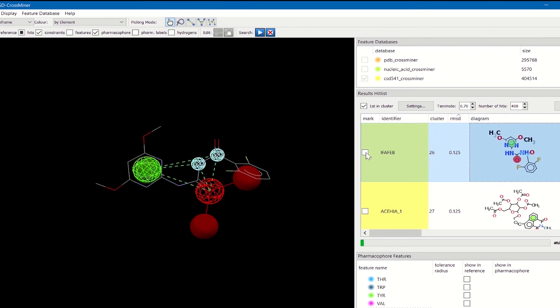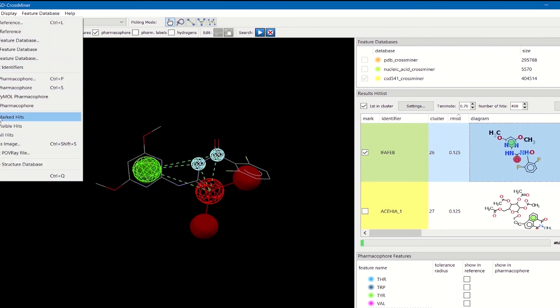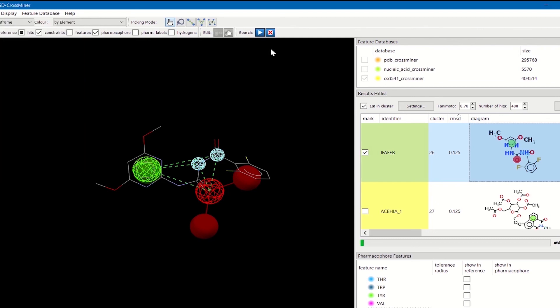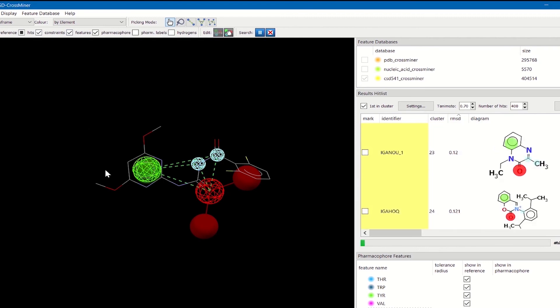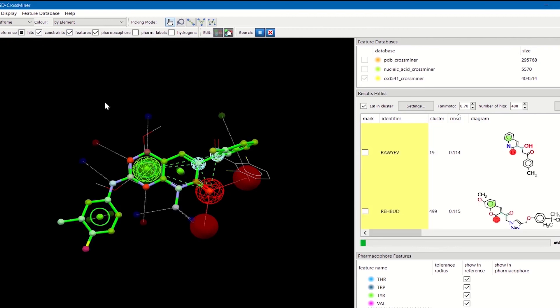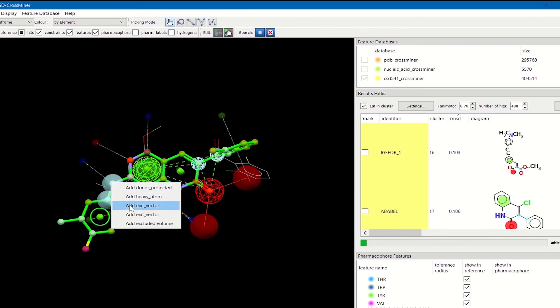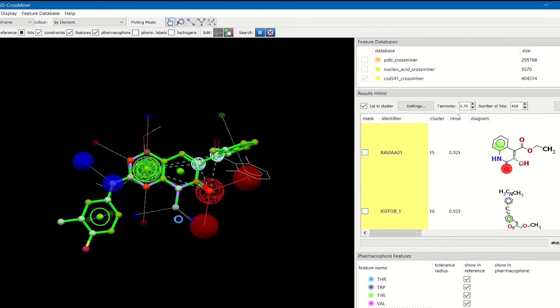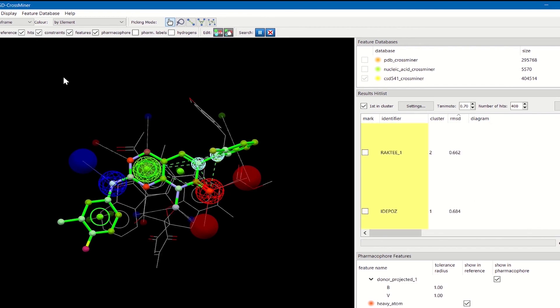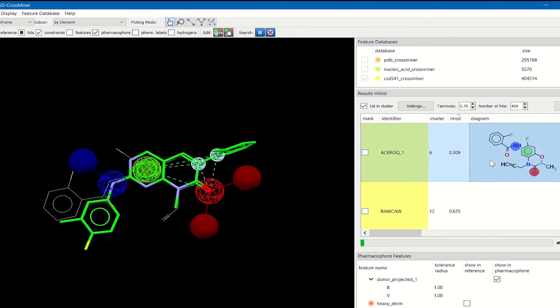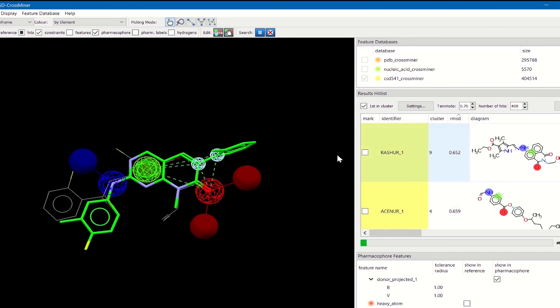Interesting hits like this one can be marked and saved for further analysis. If you want to continue your search or modify your query, you can actually do it on the fly — for example, adding a new pharmacophore point to your original query, such as a donor projected. This will restart your search and the new hits matching the updated pharmacophore query will then be displayed.